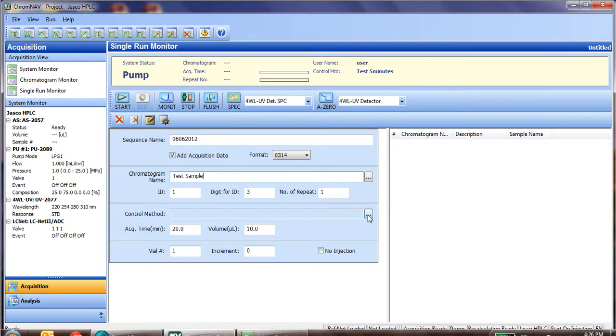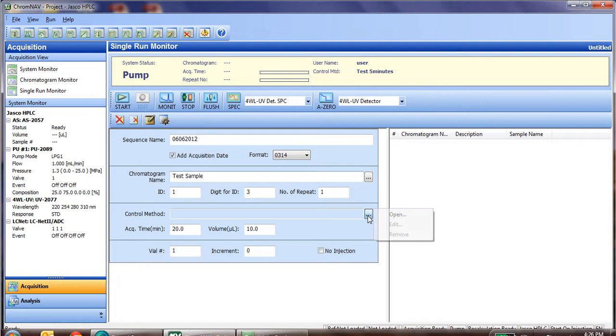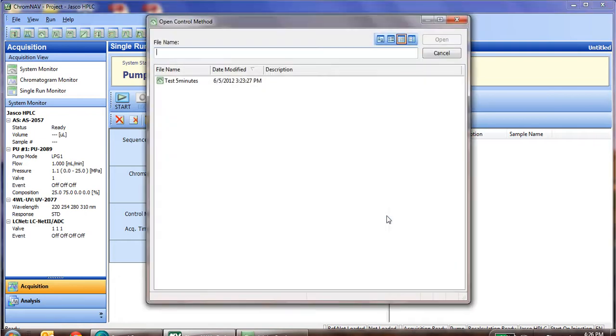You'll next select whether you're going to do any repeats. We're just simply going to do one injection, so we leave it at one. The control method, we'll enter in by hitting the dot dot dot and pressing open. We'll then select the particular control method that we want to use to run the sample.